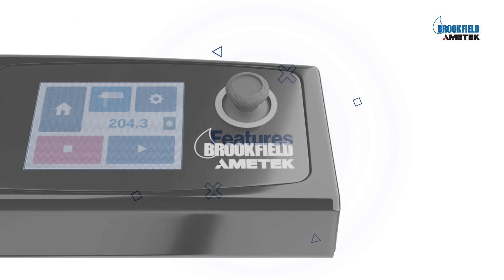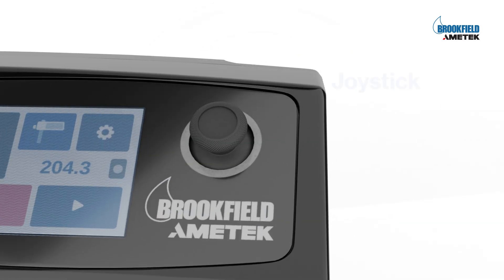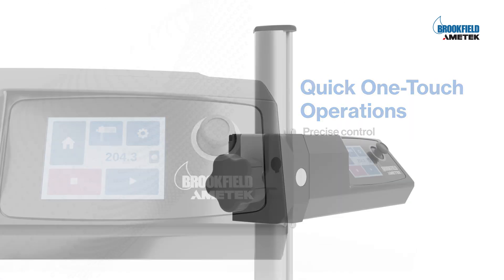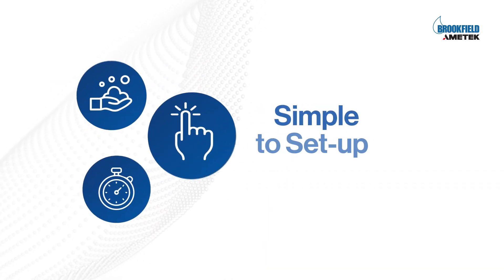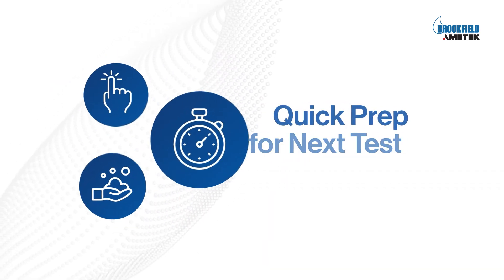Additional features include a touchscreen user interface for easy programming, joystick for precise control, quick one-touch commands, variable high-speed motorized movement, simple to set up, easy to clean, and quick prep for the next test.